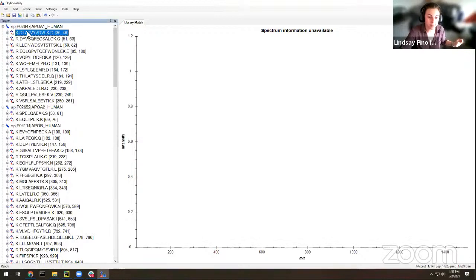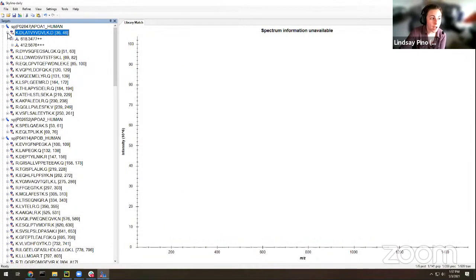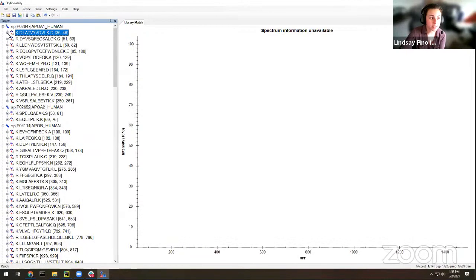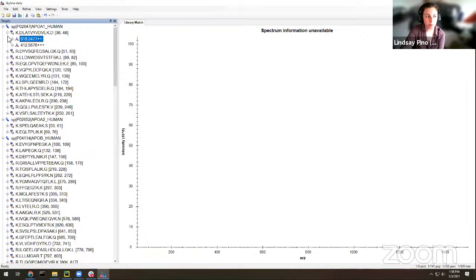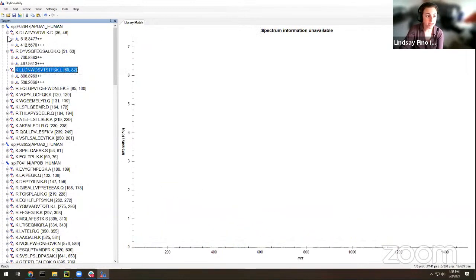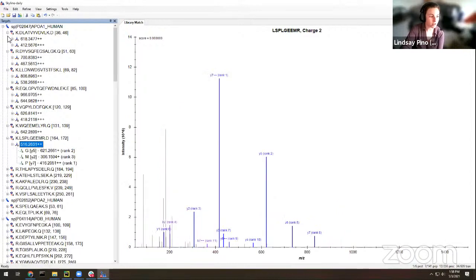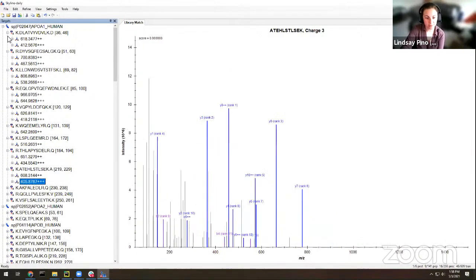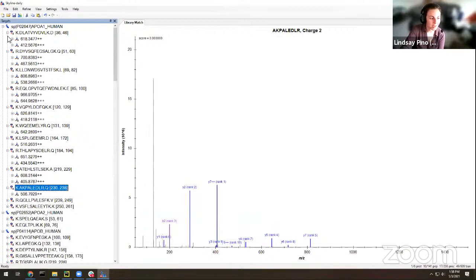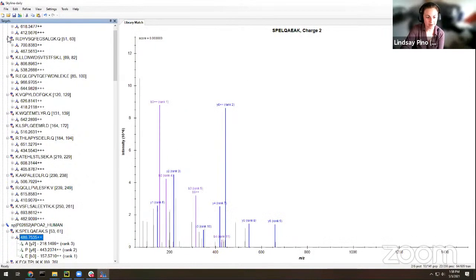If you click on a peptide, you open up the precursors by either clicking on this little plus sign, minus sign, or you can use your arrow keys. You can use your arrow keys to tab up and down, and then use the right arrow to open it up, left arrow to close it. If you open it up, go down to a precursor, now you can see the spectra. If you were doing a targeted analysis of DIA data, you might go down through some of these spectra and delete stuff that looks like junk. So far, all of these spectra look not awful. If we kept going down, trying to look for some spectra that looked really awful, maybe this particular peptide, AKP, it's not the best spectra I've seen. Maybe I would delete that so that I don't even bother pulling that data in because it looks kind of junky.